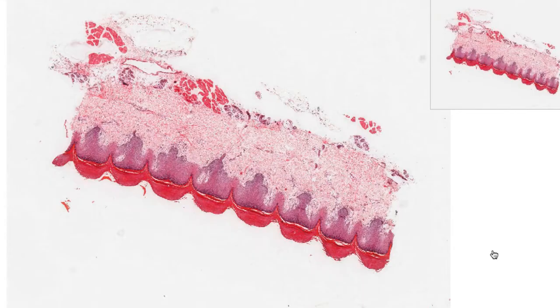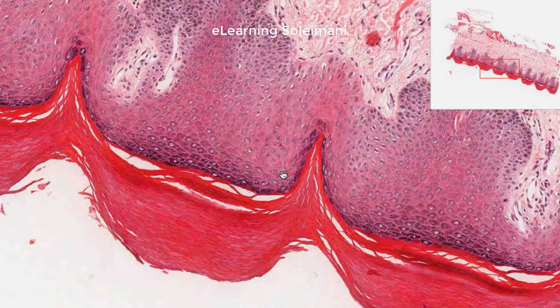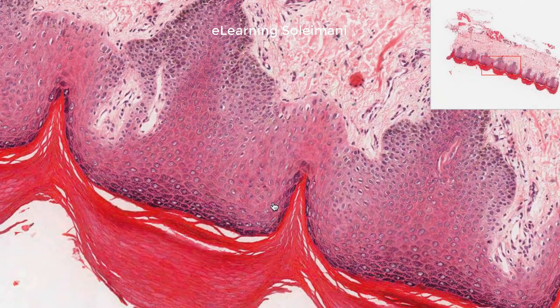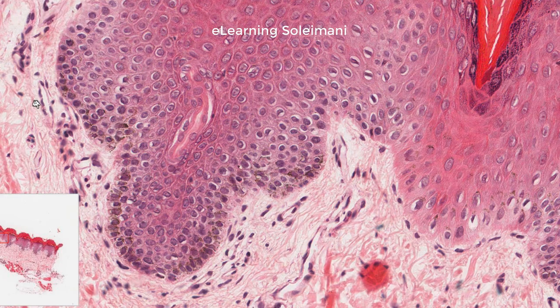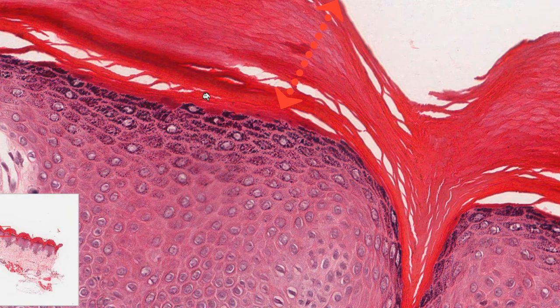The next slide is the skin. The epithelium is stratified squamous keratinized. The skin contains both epidermis and dermis. With higher magnification, the epidermis of the skin can be seen. In the epidermis, there are basal cells, followed by cuboidal cells, and then several layers of cells that accumulate keratin inside the cell and lose their cell structure.